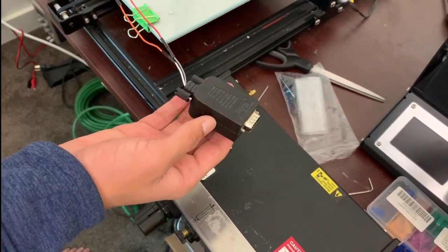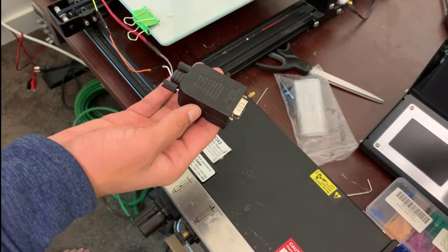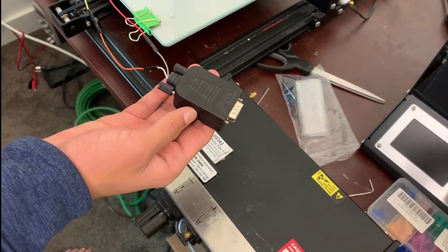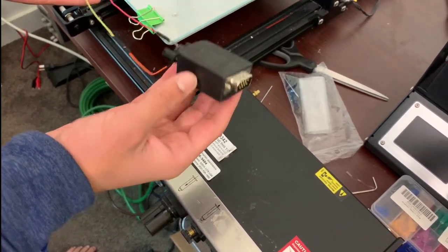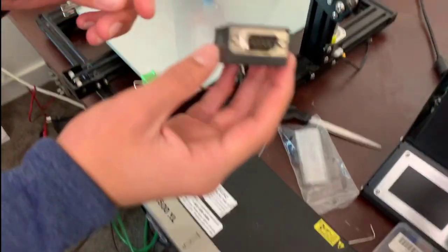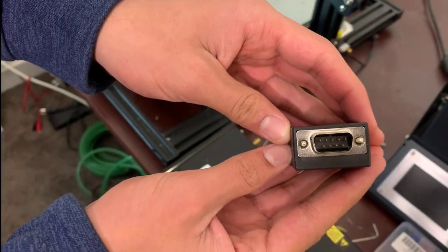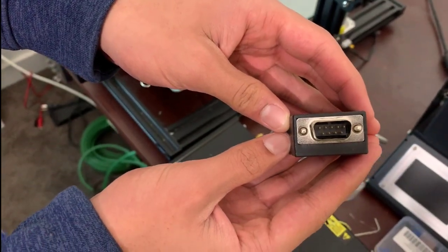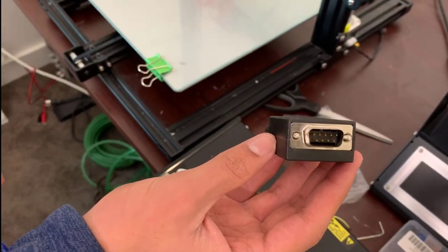Now that we've set up the air compressor, we're going to be setting up the electrical connection between the EFD dispenser and the actual printer. We're going to be using a nine pin serial port that will connect to the EFD dispenser.